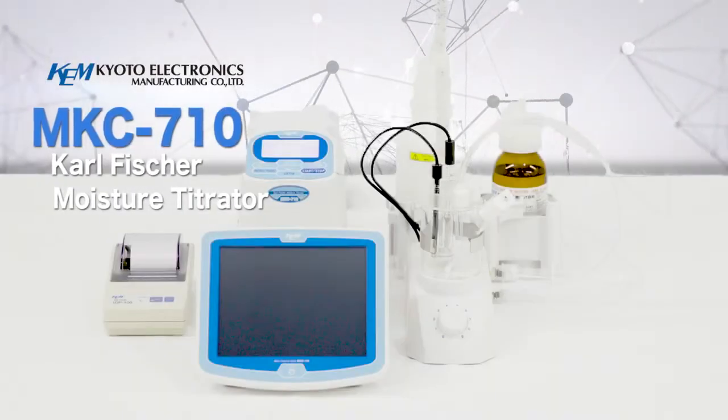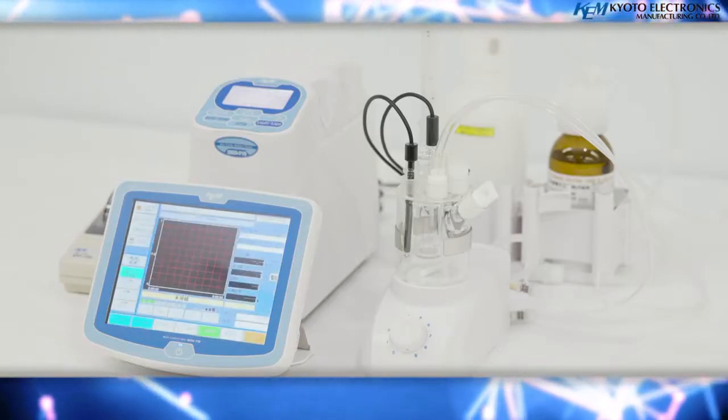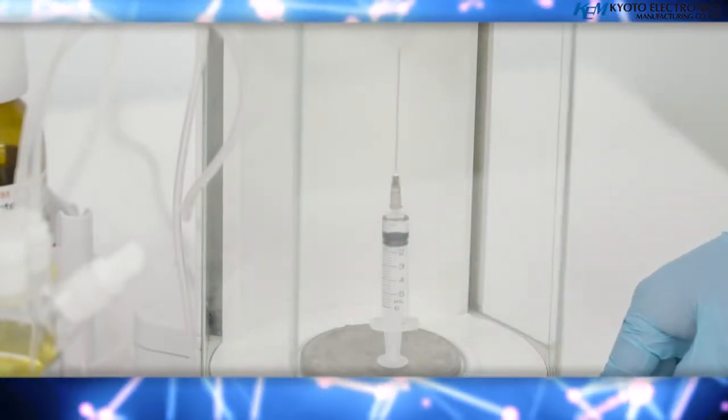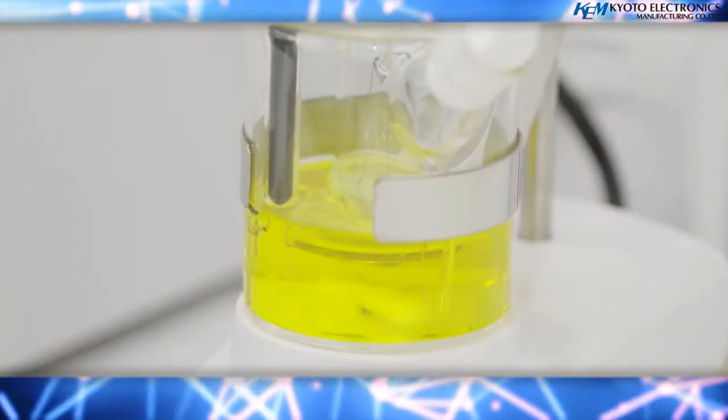Karl Fischer Moisture Titrator, MKC 710. The MKC 710 is widely used for determining the moisture content of various substances as a reliable moisture meter that has been adopted in many official analysis methods such as the ASTM, JIS, European Pharmacopoeia, and the United States Pharmacopoeia.